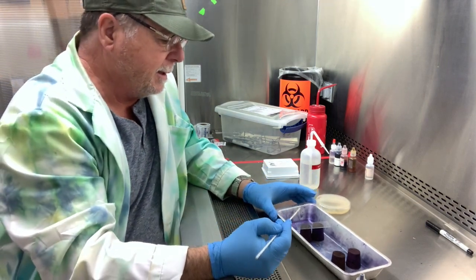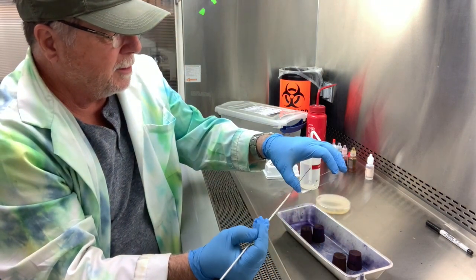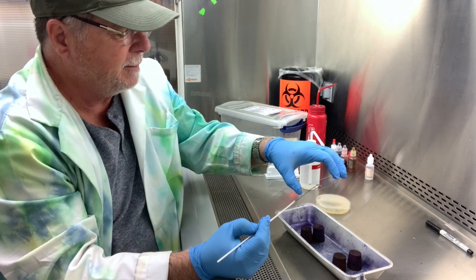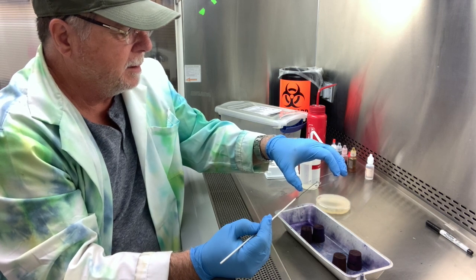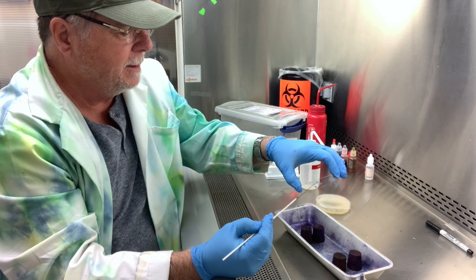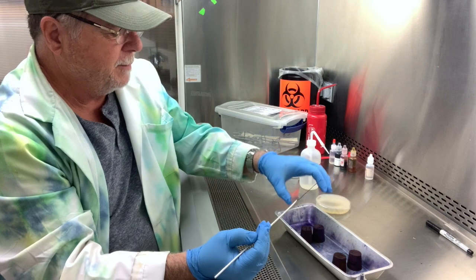Okay. All right, now I'm going to take the white speck and put it in the drop of water, and then I smear it out to about the size of a dime. Depending on your colony, it'll be more likely to spread well, but you just want to create a film.